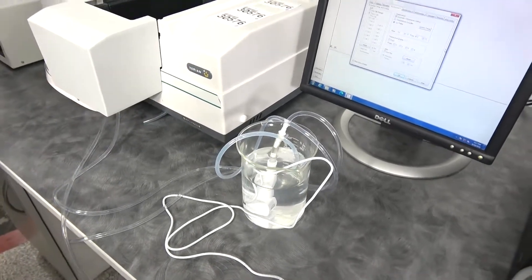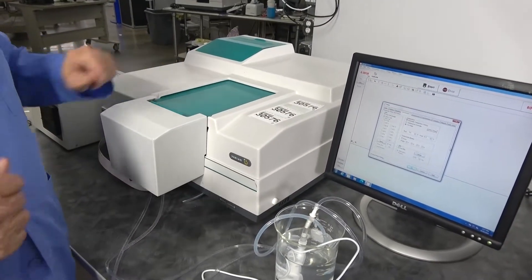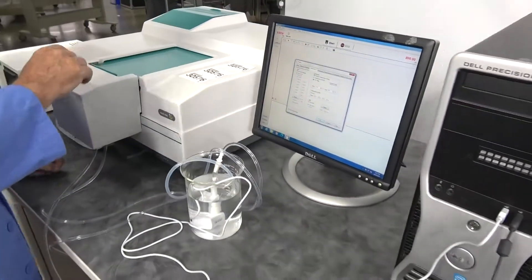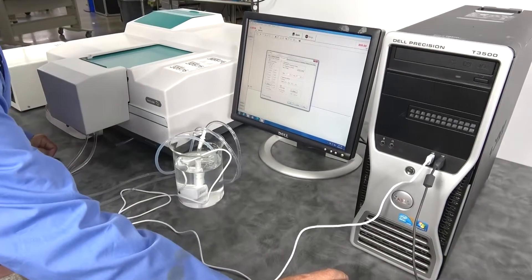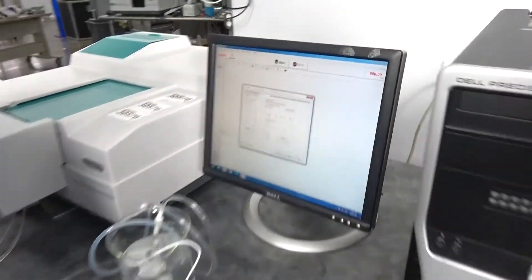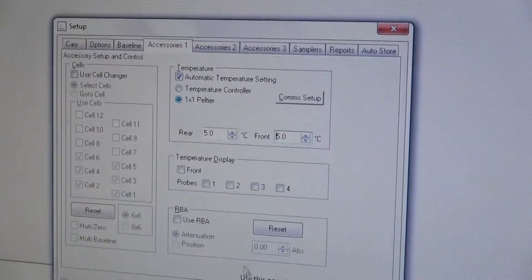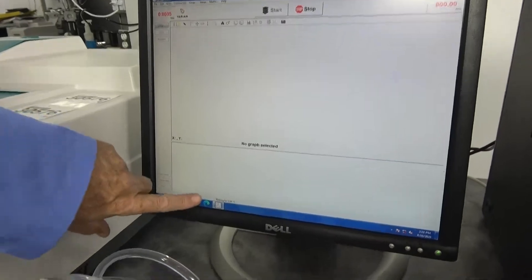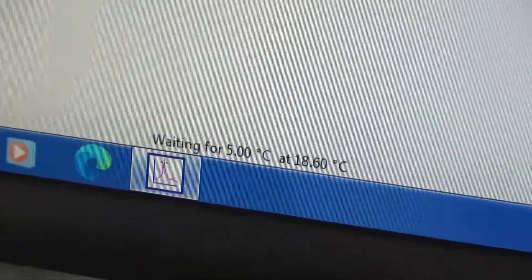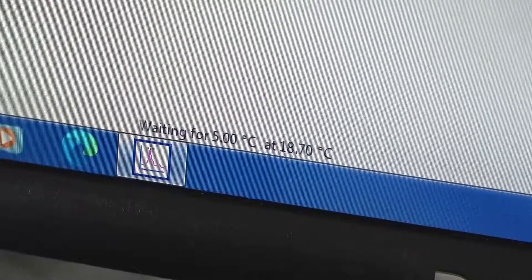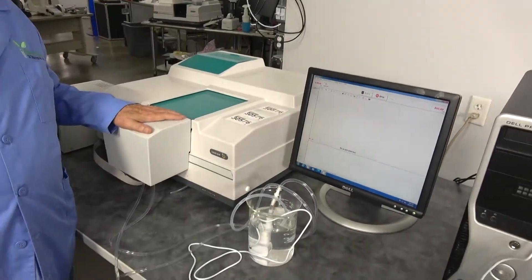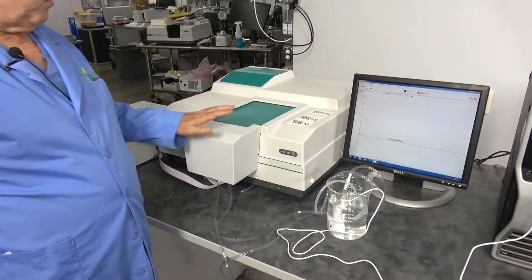This unit, in cooling, is actually running. And when you do have the unit, you go into the accessories, the setup, you set your temperature, the one-by-one peltier, click OK. It'll show your temperature and what it's waiting for and the degrees that it's running. It will wait to run your scan until it gets to the correct temperature.